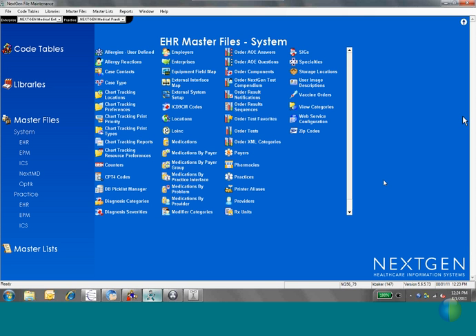All right, so we're going to go ahead and move forward from the file maintenance section. So if there are any further questions about file maintenance, please make sure you put those in the chat board so that we can get to them quickly here. And now what I want to do is I want to move forward into talking about the actual order module functionality and how we use it.